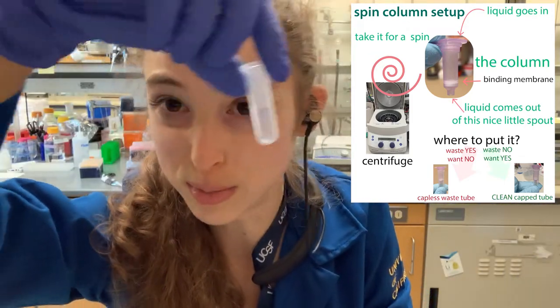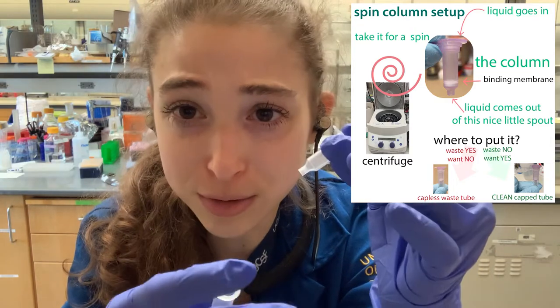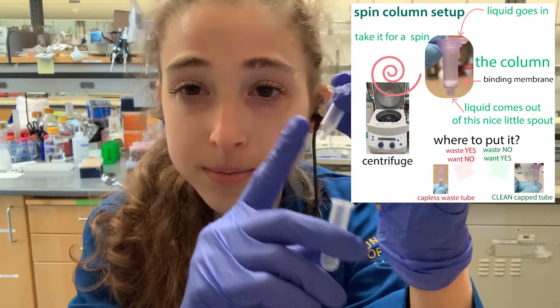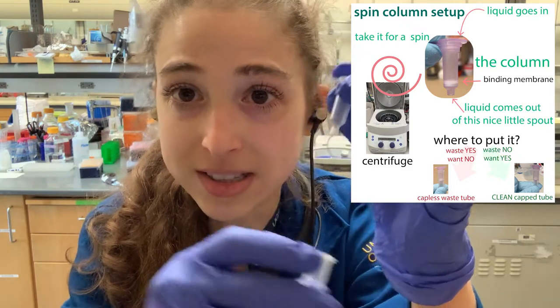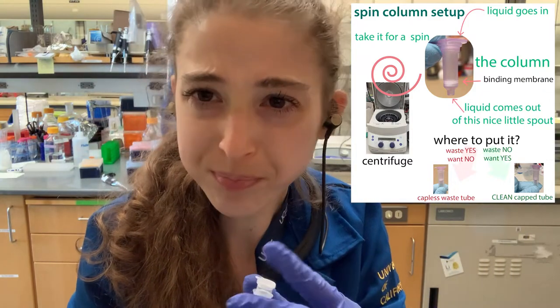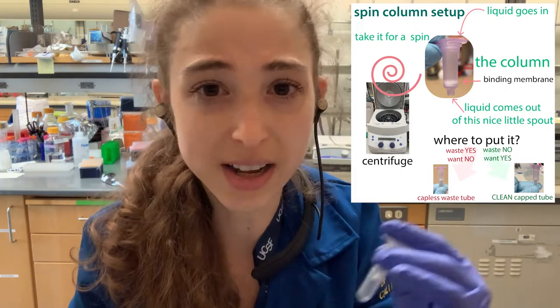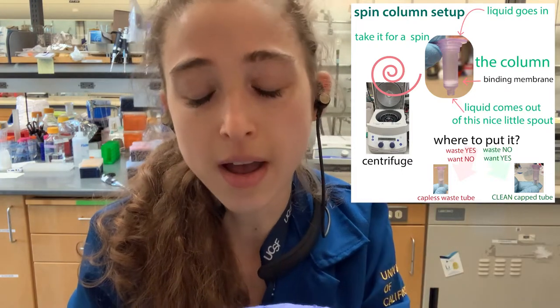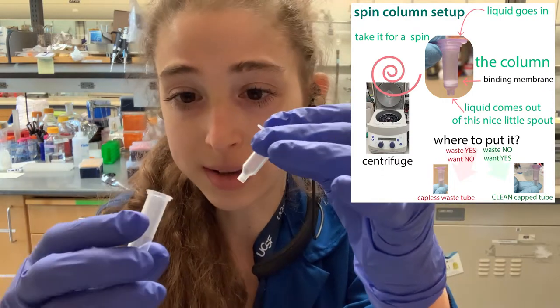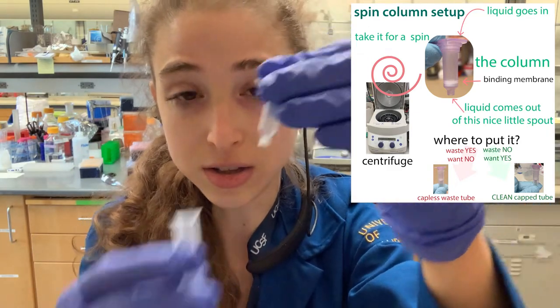This is why for wash steps you use a disposable base that you can discard, but when you elute, you put the column into a nice clean tube. If you have gunk on the outside of your concentrator or column, you're putting it back into that gunk. This is especially important for mini preps, where you could potentially have contaminating DNA from bacteria.